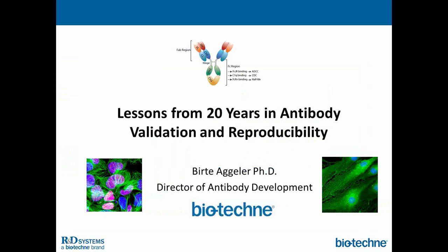Okay. And is there any predictability between the antibodies when you're validating for a number of different applications? Are there any predictors of what might be good for an antibody perhaps in a direct immunoassay as opposed to one for a Western blot or flow cytometry? That's a tricky question to answer. I have not seen any true indicators for predicting an antibody from the start whether or not it's going to work in a specific application.